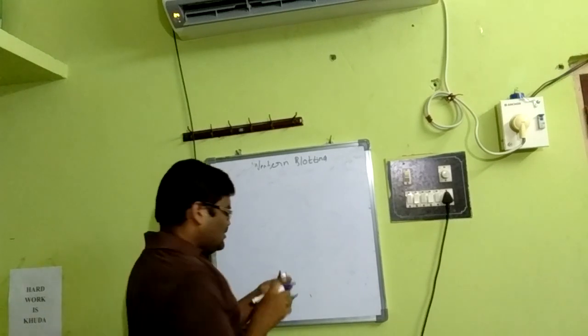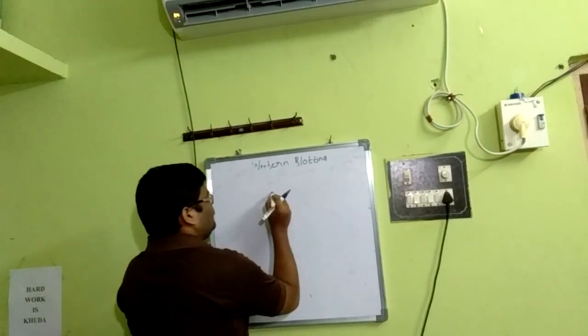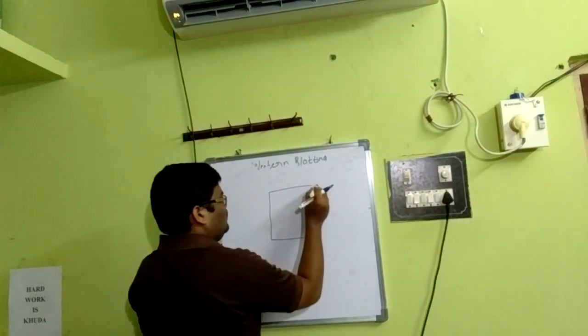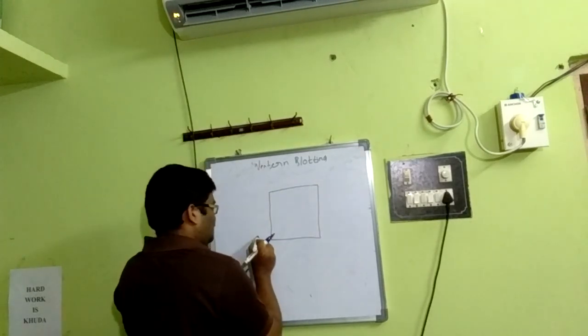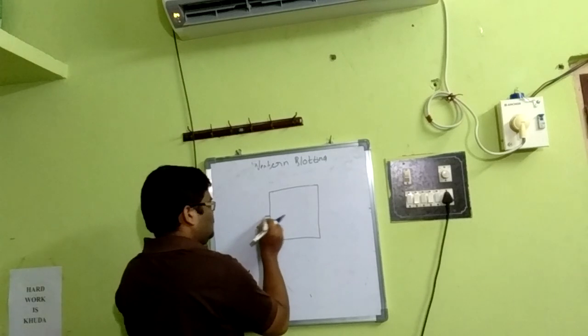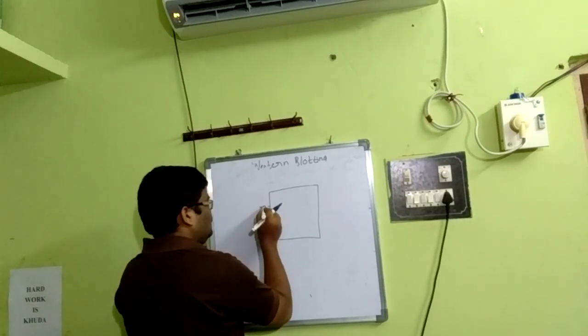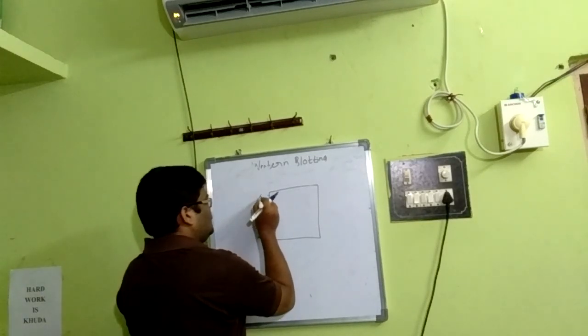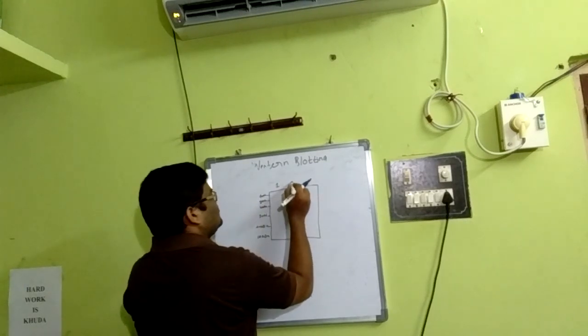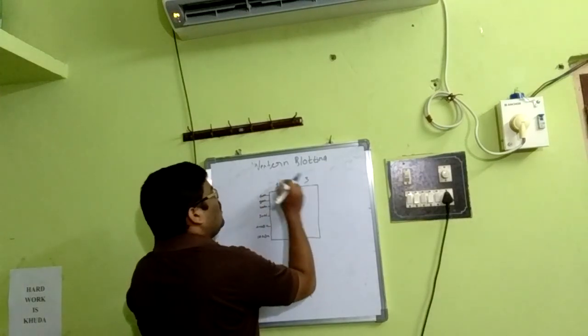Say this is a nitrocellulose membrane or a PVDF. Measured in kilodaltons, this is 20 and 30, 40, 50 and 60. This is line 1, this is line 2 and line 3 of different sources.